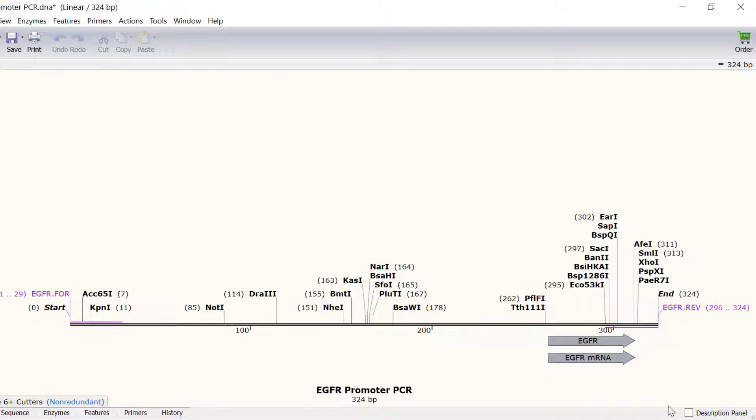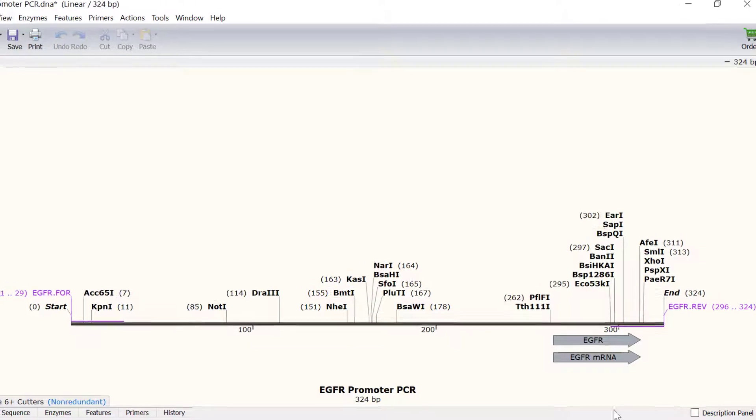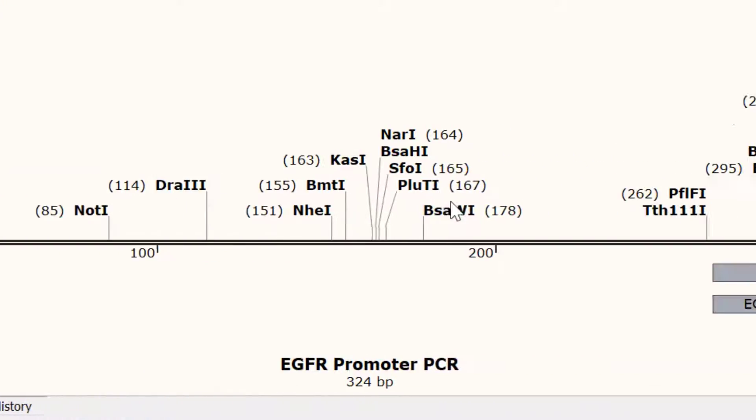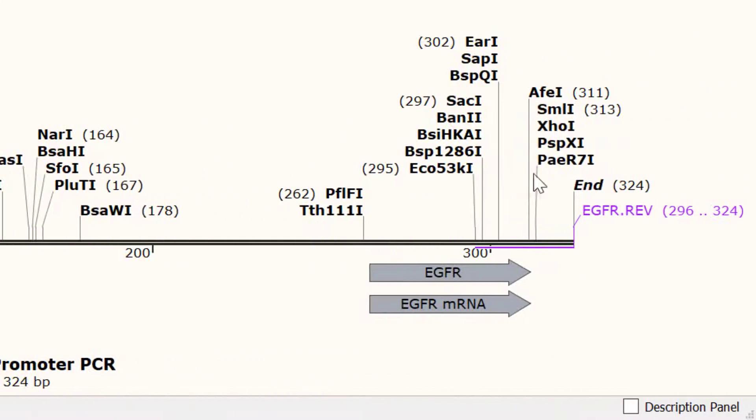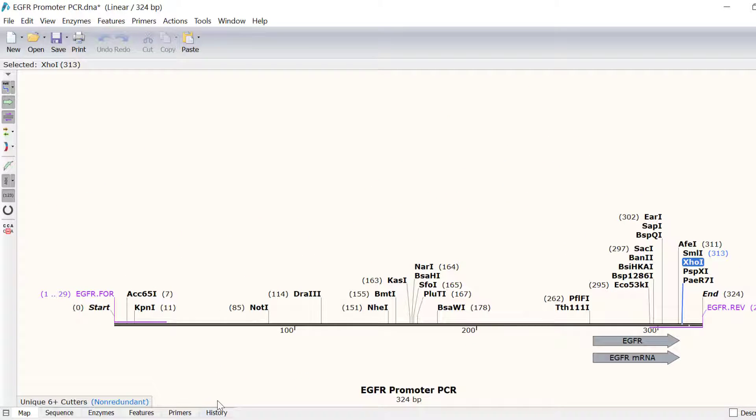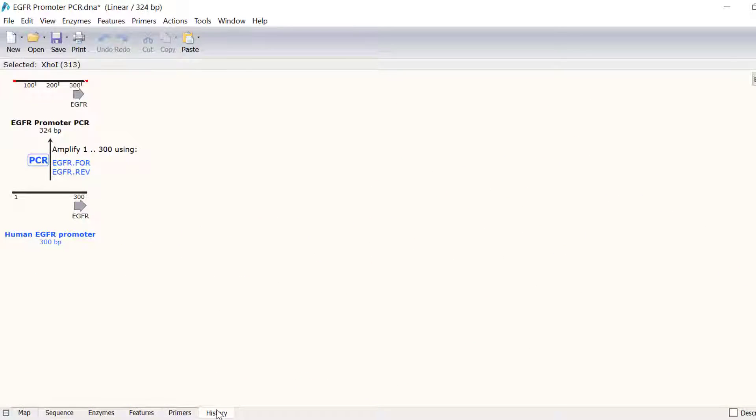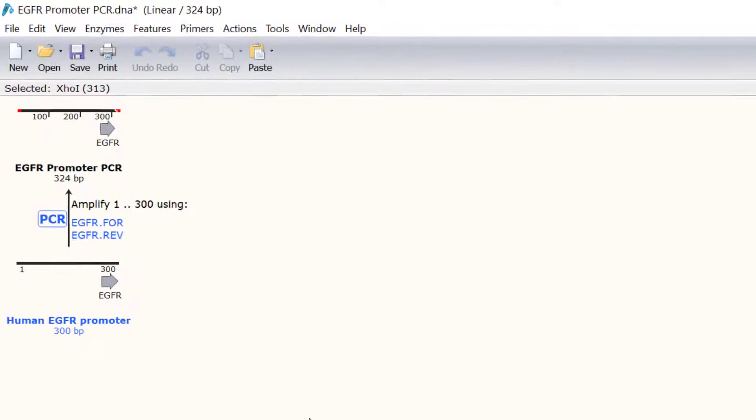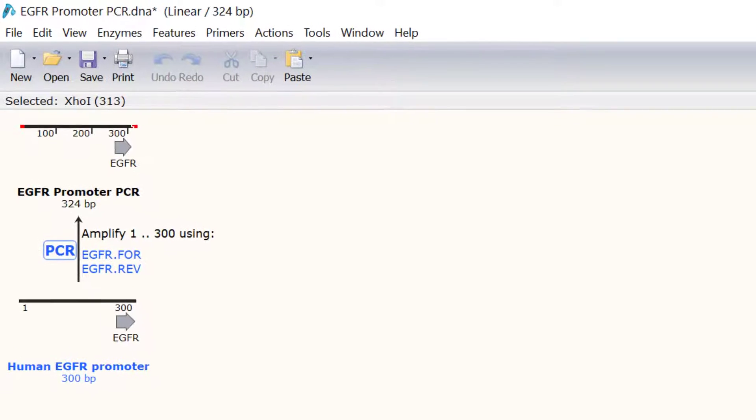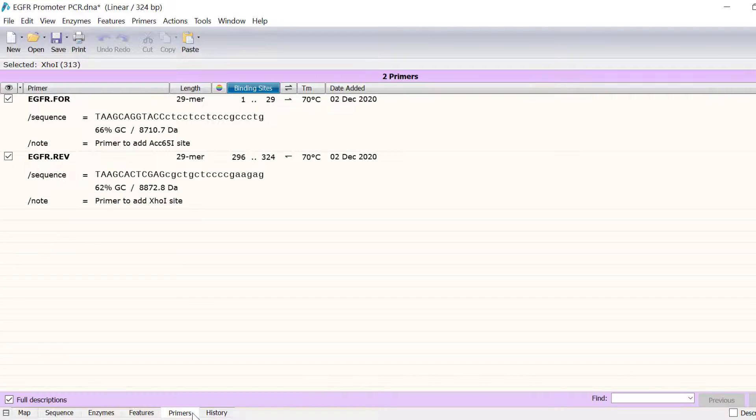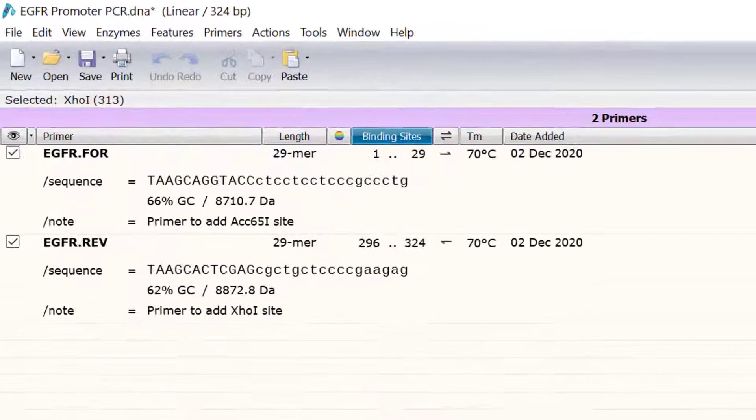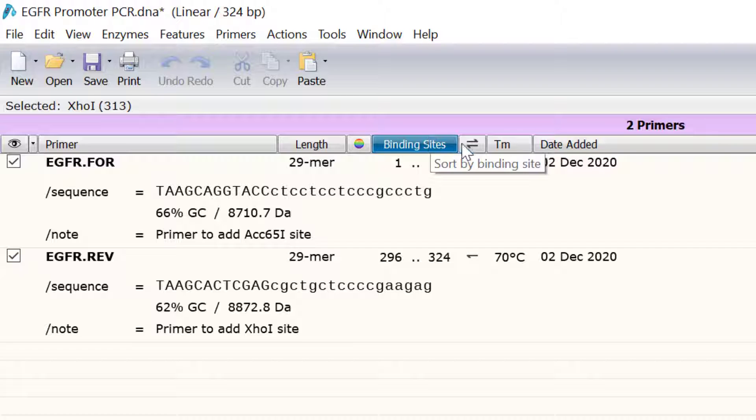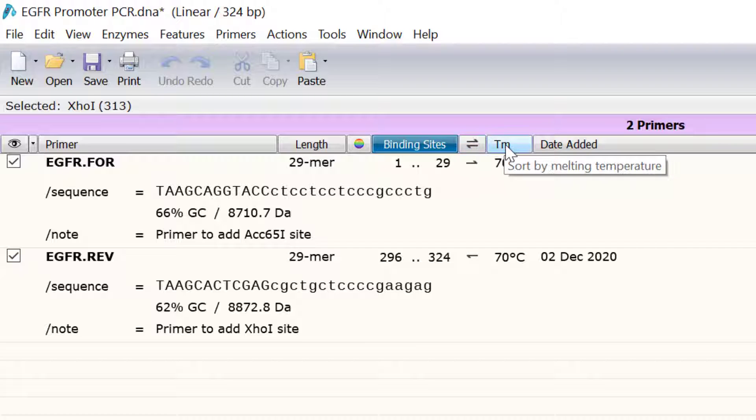In this new file you can see that the ACC651 and XHO1 sites have been added to my sequence. Switching to the history view will provide a schematic flow chart of the steps I have just performed. If I go to the primers view I can see the list of primers used in this file. You can also see additional primer information including the sequence, binding region, directionality and melting temperature.